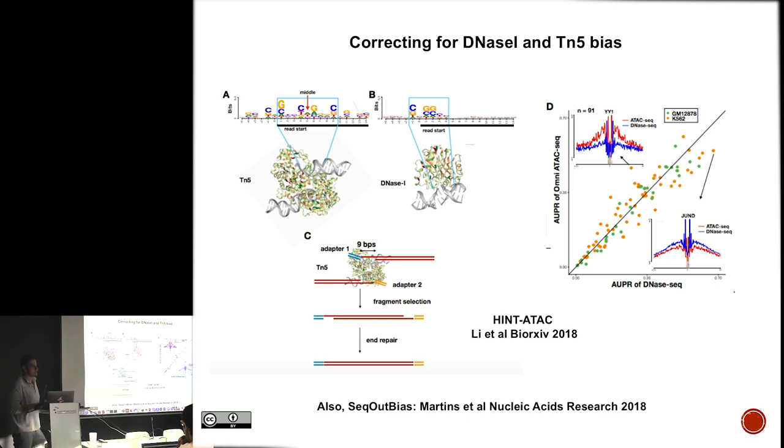And do you have any false positives coming from this bias in the Tn5, like a blacklist of motifs derived from this bias? Yeah, very GC-rich motifs would be biased. That's actually relevant because SP factors are GC rich, so there are some transcription factor motifs that would be a huge false positive in this analysis, which is why leveraging expression data and the biology is also important. So not just an agnostic analysis, but something that's somewhat supervised in a sense.